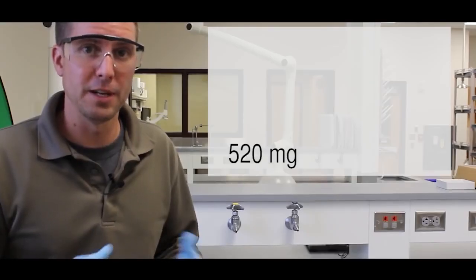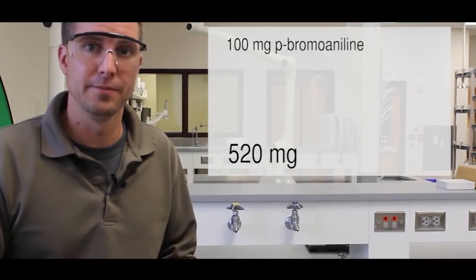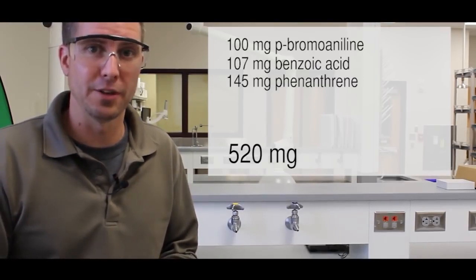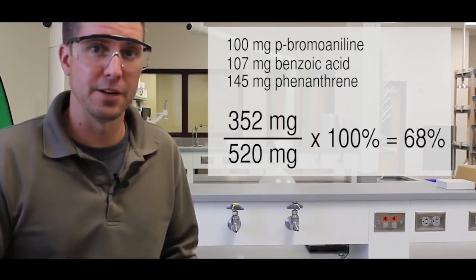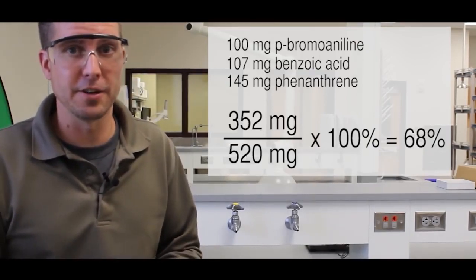I started with 520 milligrams of the mixture. I ended up with 100 milligrams of p-bromoaniline, 107 milligrams of benzoic acid, and 145 milligrams of phenanthrene. So the percent recovery was 68%. This value makes sense because I lost some of it during transfers.